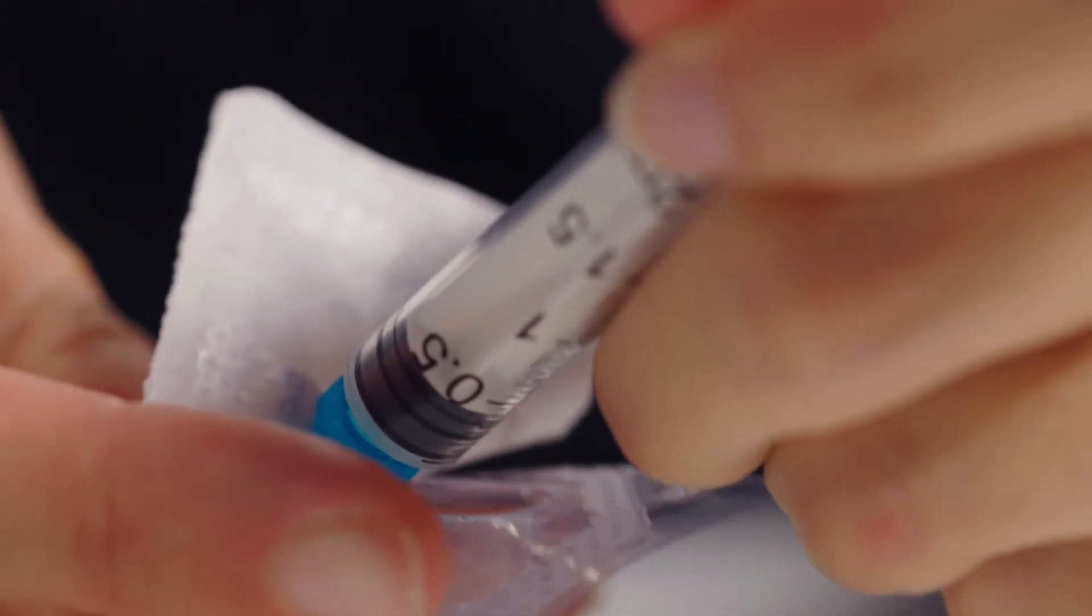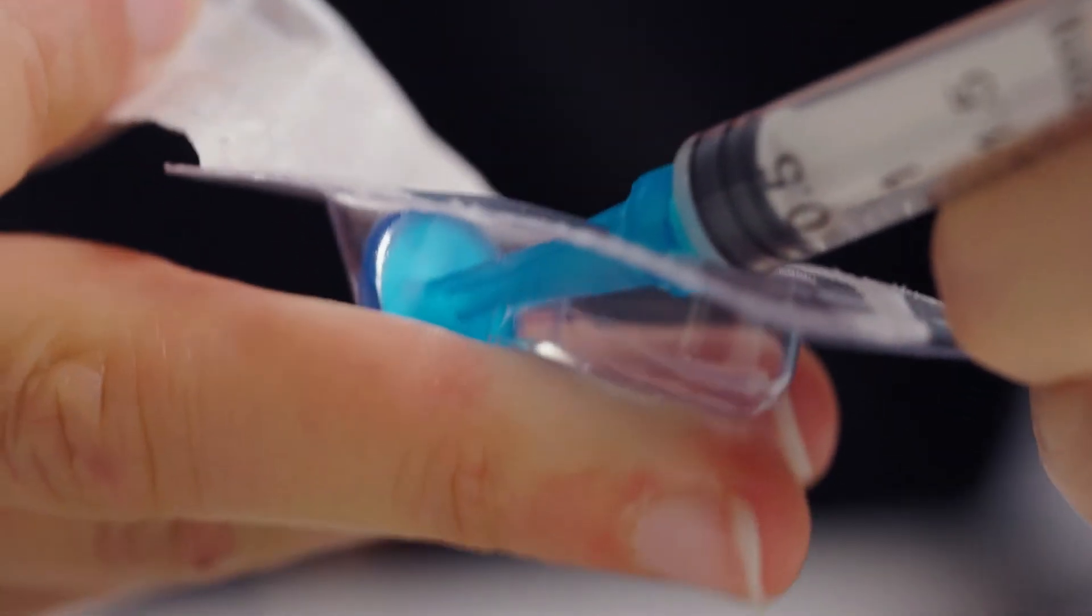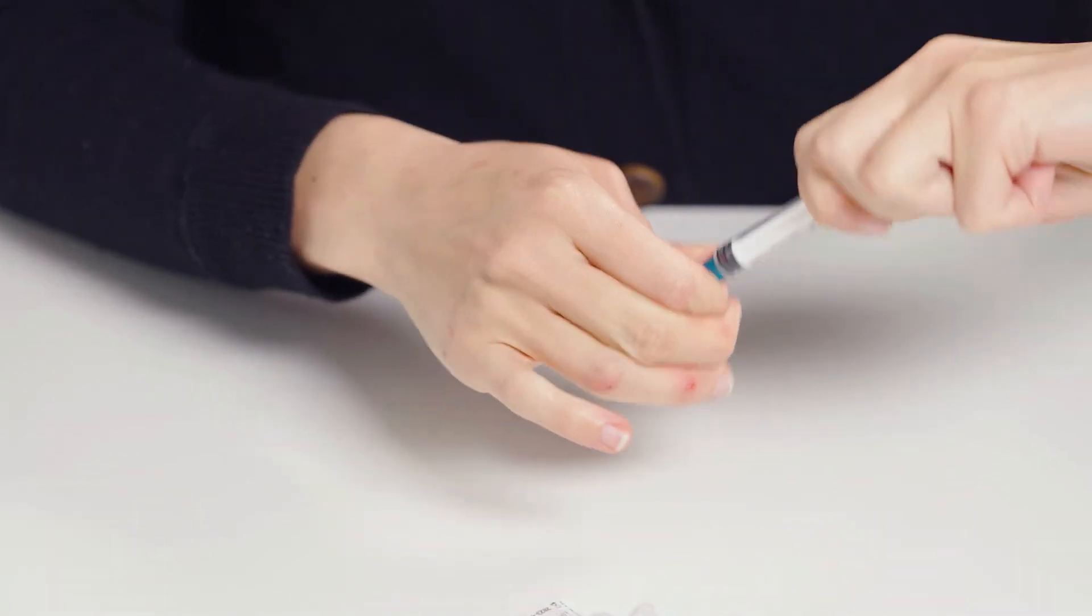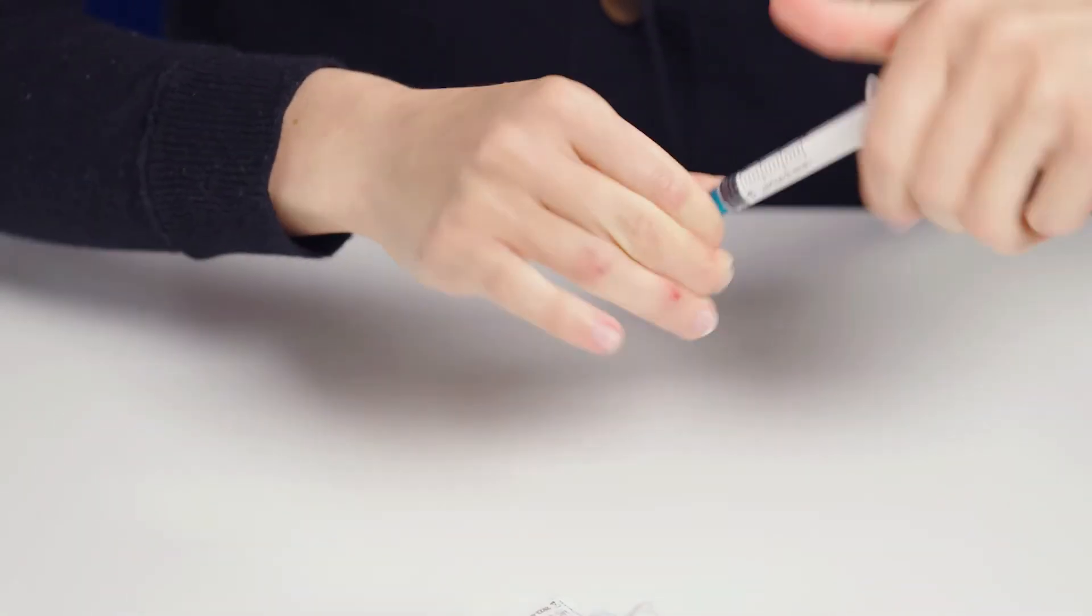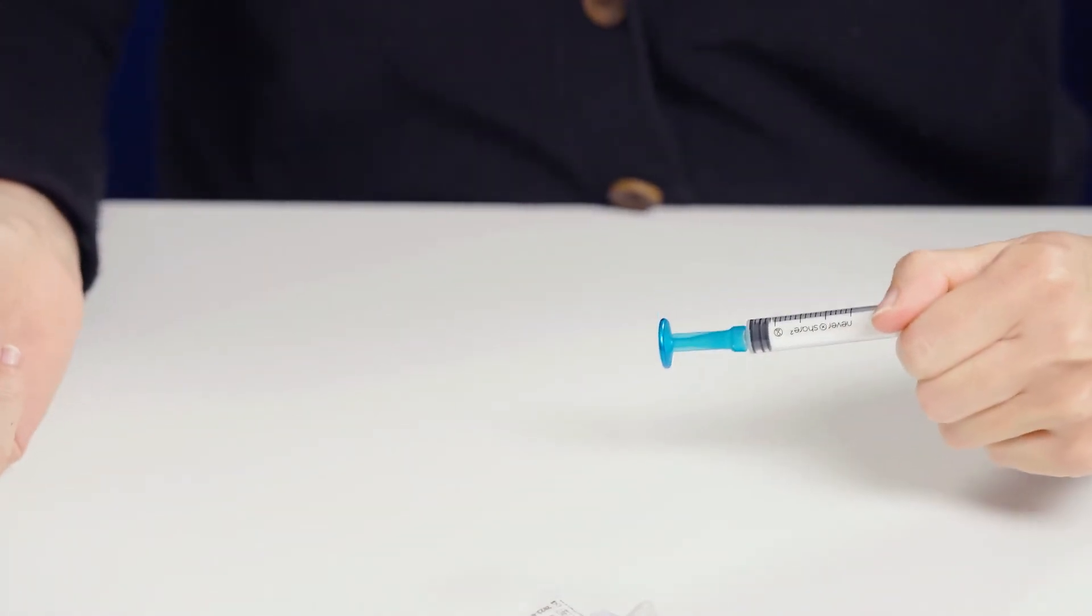Next, insert the syringe into the filter. To ensure a good seal between filter and syringe, twist the syringe within the filter one full rotation. The filter is now correctly positioned.